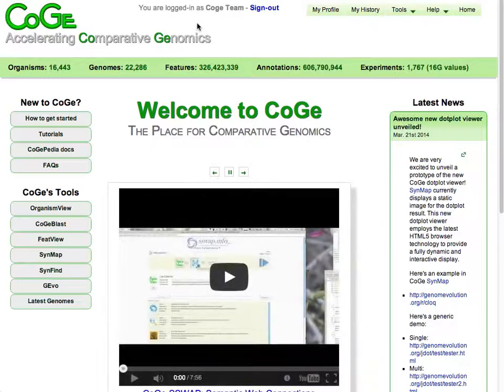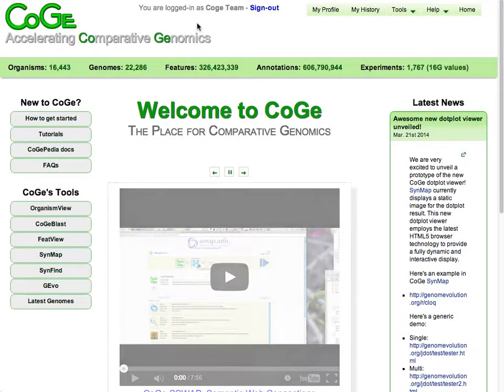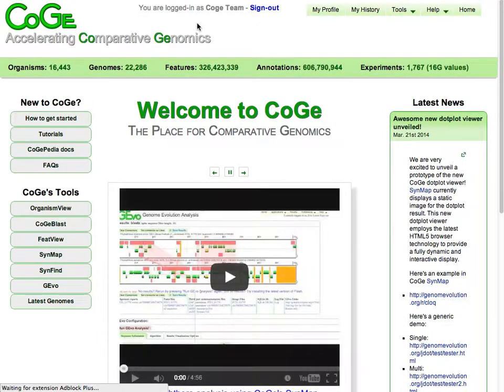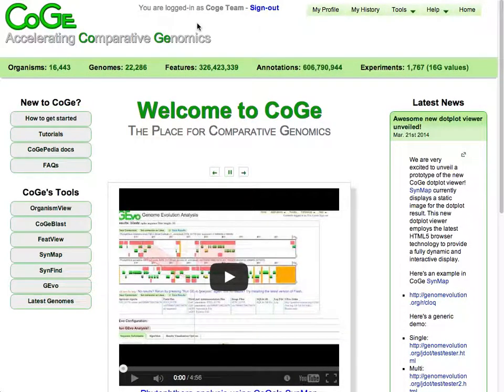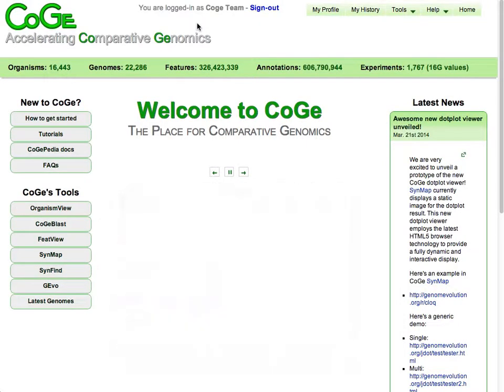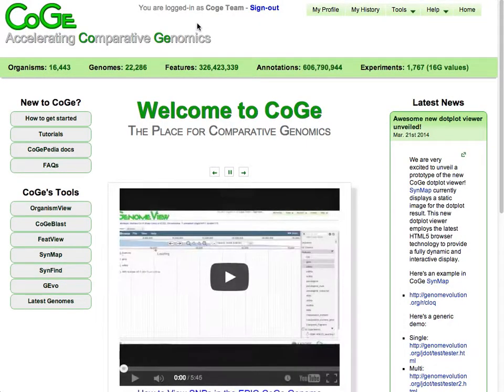Hi, this is Eric Lyons, and this video tutorial will show you how to use COGI's RNA-Seq processing pipeline. This project is a collaboration with James Schnabel at the University of Nebraska and the COGI team developers Matt Baumhoff and Evan Briones.